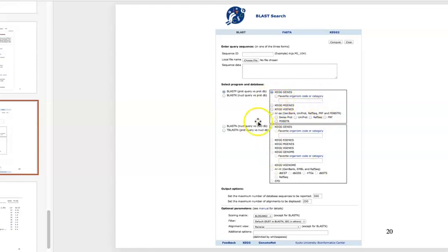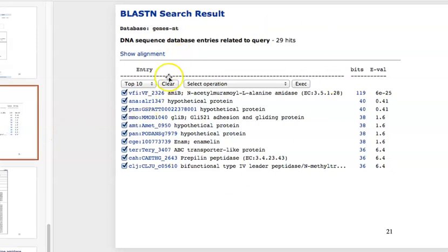But anyway, the point is you can be highly specific and then compute, and then I would get a return of sequence alignments. And here's the top scoring one, again, the MEB, and then the E value, 6 times 10 to the negative 25, which again suggests that it's a highly similar match. And then I can get some other examples of homologs and other microbes. And again, you have to kind of know what these different abbreviations are. But here's VFI, Vibrio fischeri, and then the particular gene annotated in the genome.